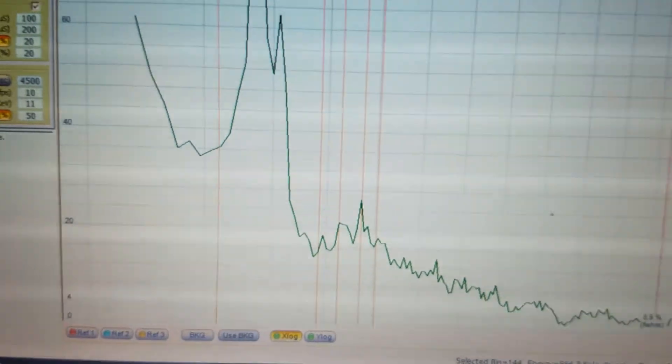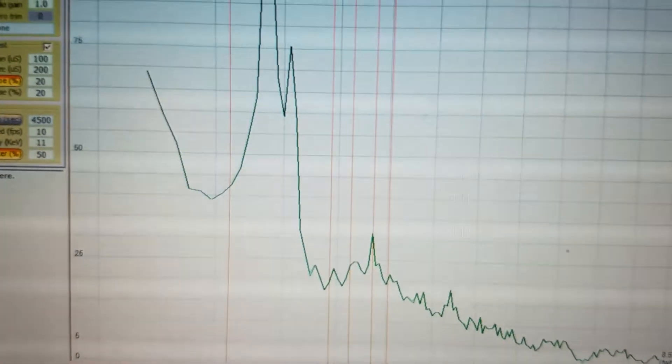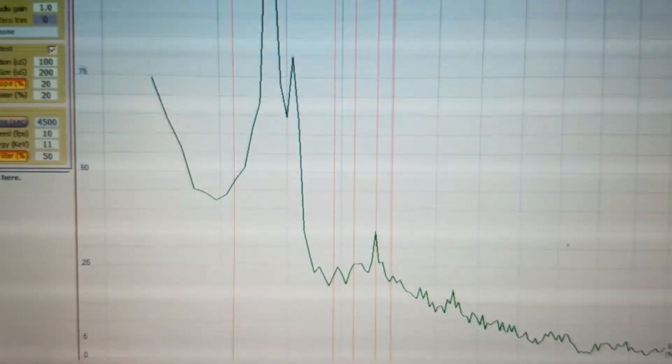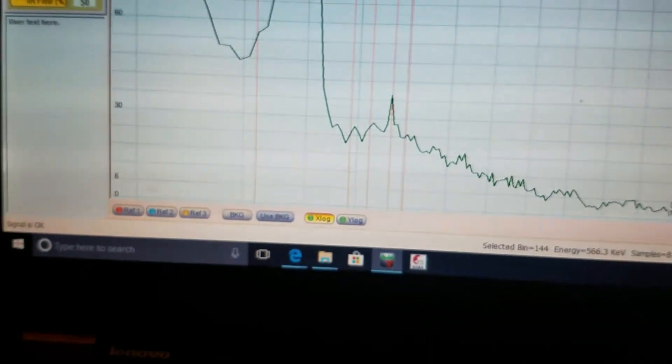In comparison to the natural yellow cake, which is this, that United Nuclear DU sample is noticeably weaker.